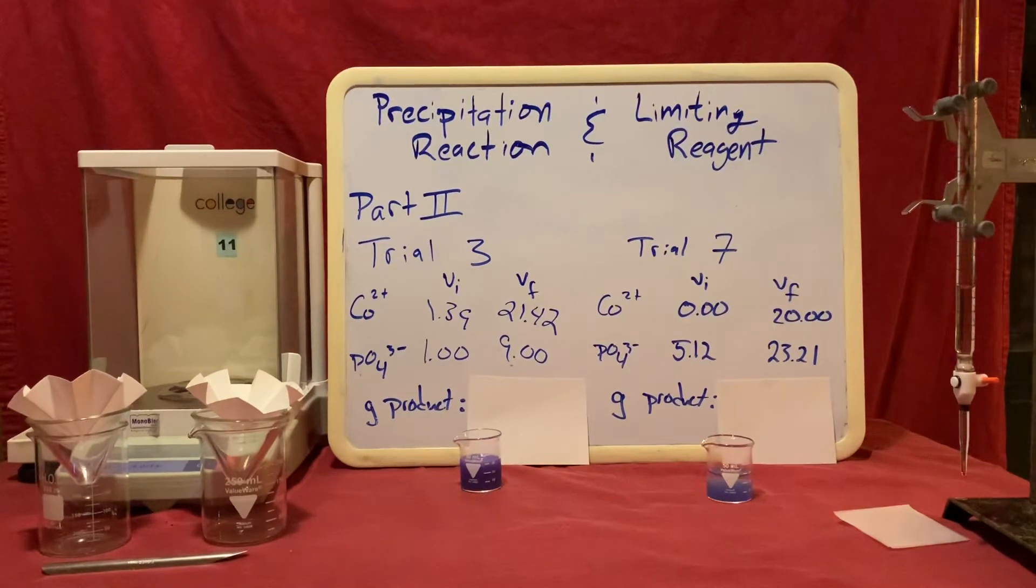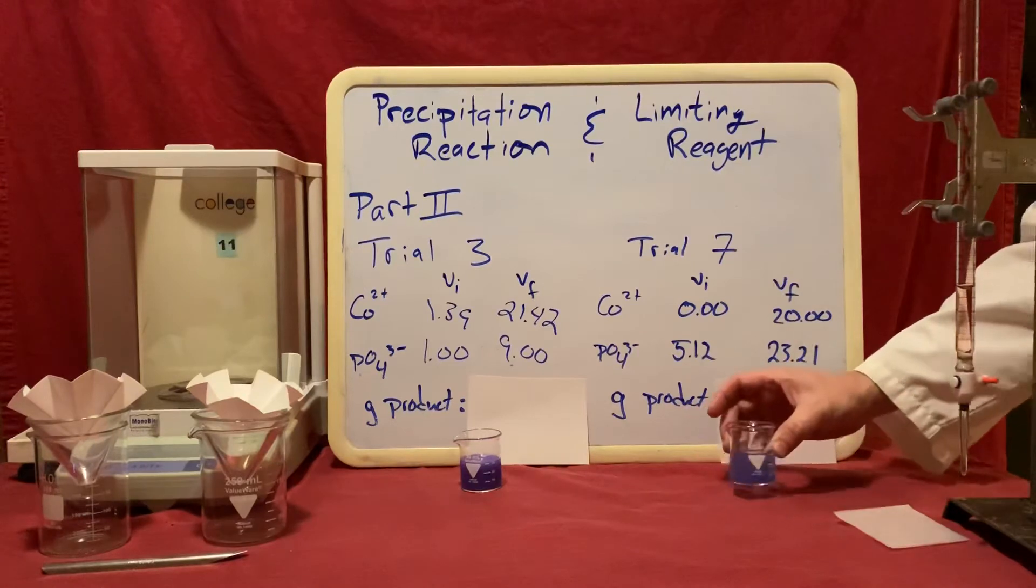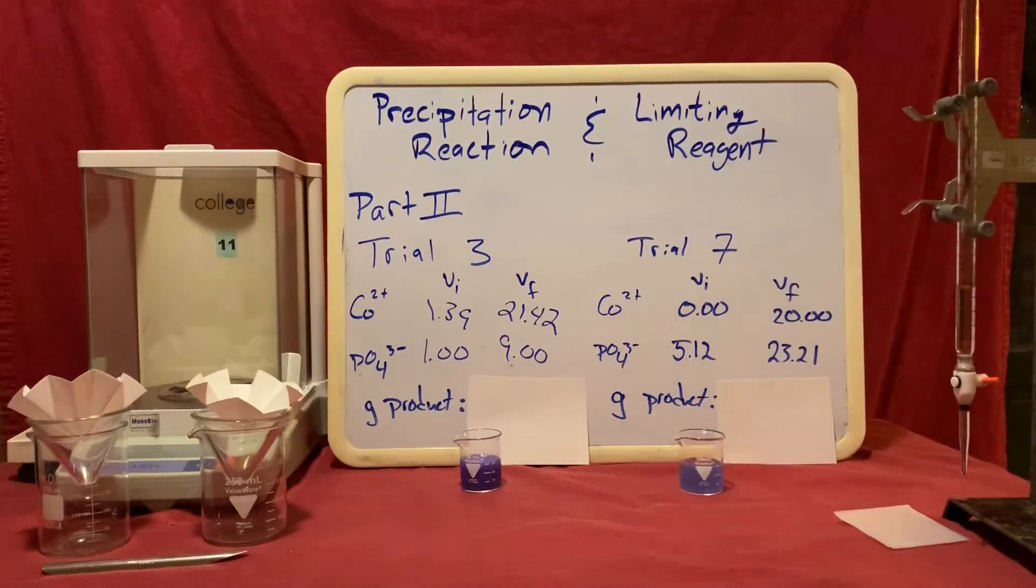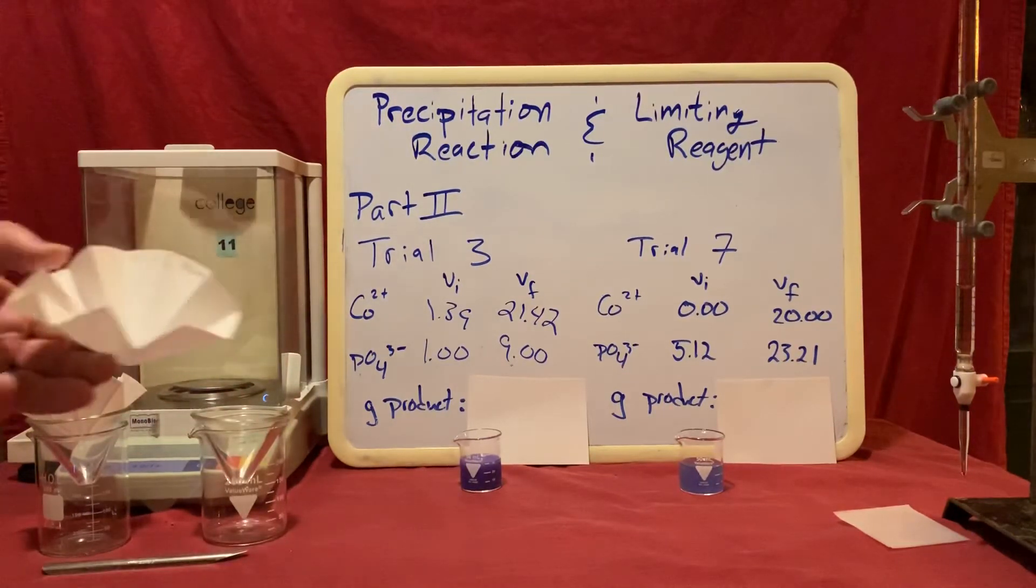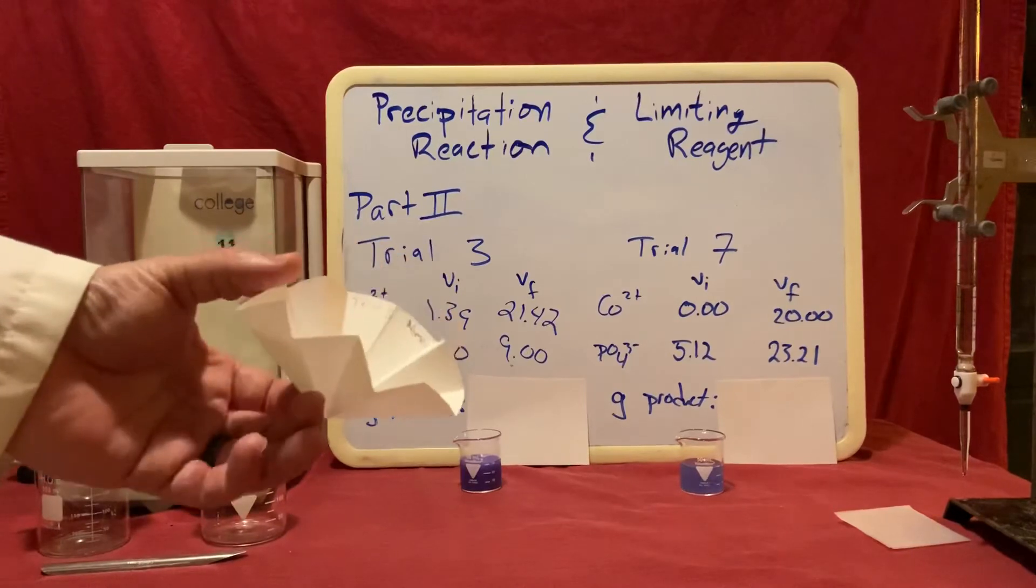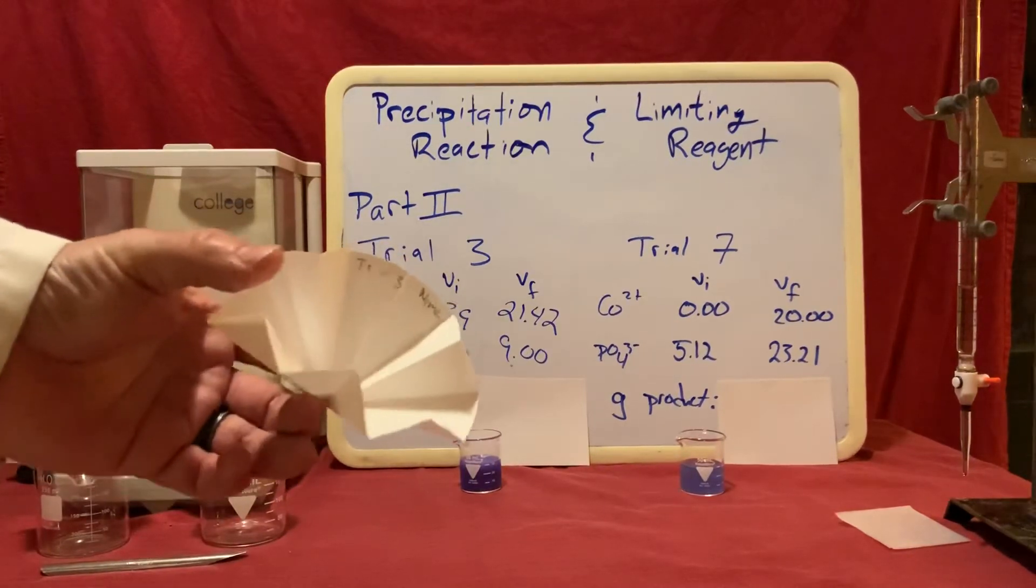Now once these have had the opportunity to react for 10 minutes, we're going to filter them in order to collect the solid to determine our yield. Before we do this, we want to prepare our filter paper. You can see here that I have fluted this filter paper. I folded it so that it'll be easier to filter our solids with.